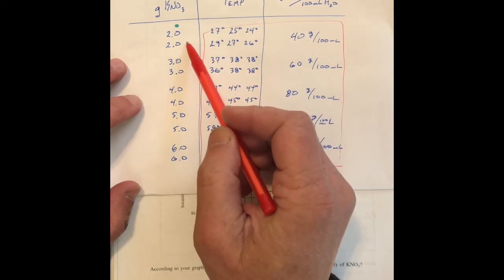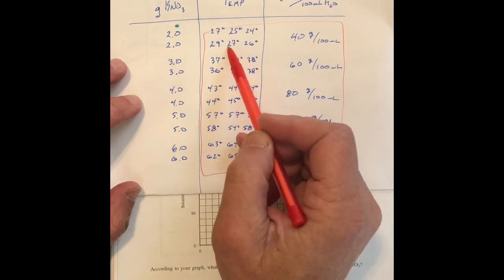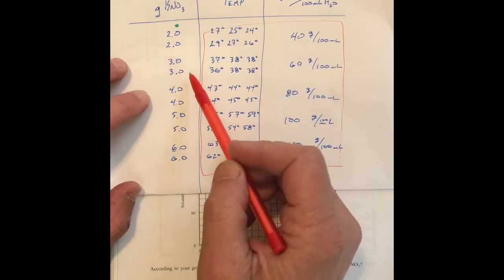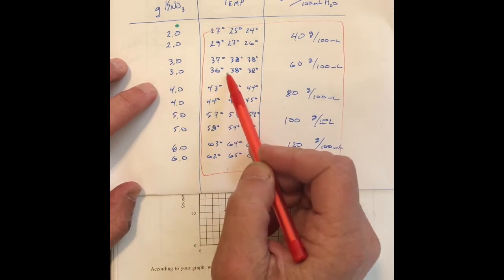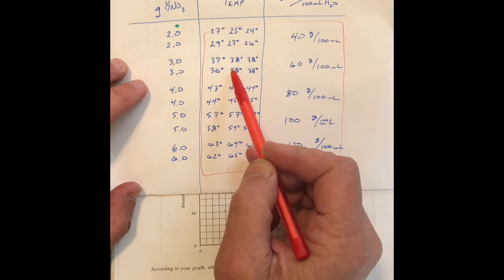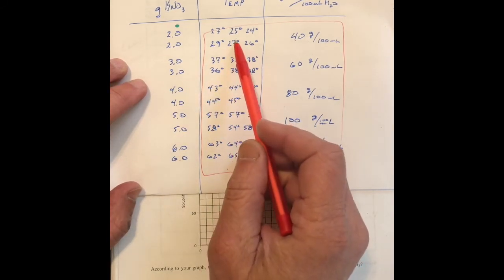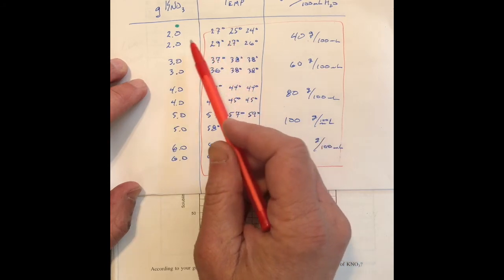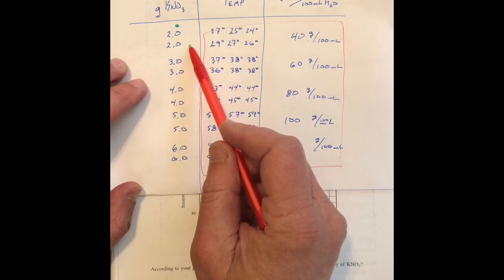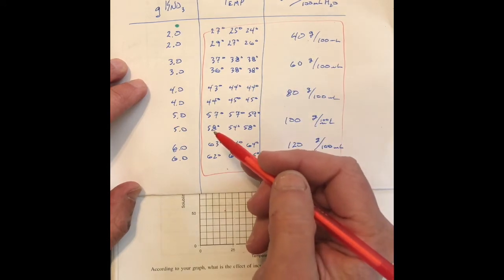So again, at 2 grams of potassium nitrate, we're seeing these kind of high 20s temperature. When we go to 3 grams, that takes a temperature of 37, 38 degrees. If we'd had 3 grams of potassium nitrate and we were at 27 degrees, 2 grams of the potassium nitrate would have dissolved and 1 gram would have been just left as a crystalline solid in the container.